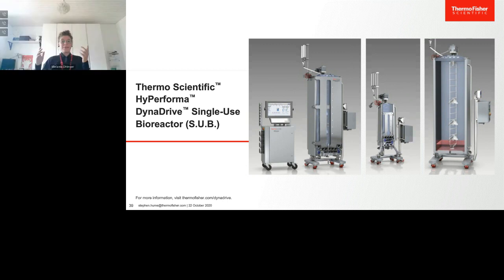Yeah, thanks. So in order to make our conversation a little bit more hands-on or practical, can you provide us with some examples of how the DynaDrive has been used in intensified or continuous processing?